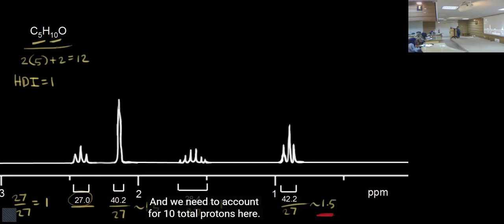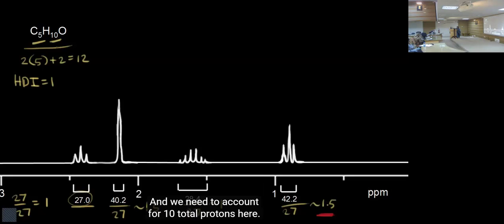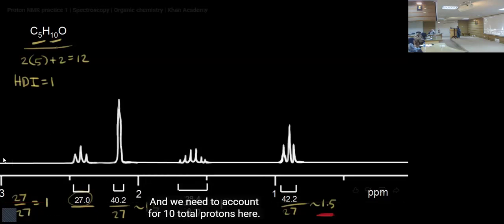You have to first figure out, most often about 99.99%, that the compound you isolate belongs to one of the classes that have already been reported. So you compare the NMR spectrum with the previous one already reported and find out something new in it, which has not been reported.